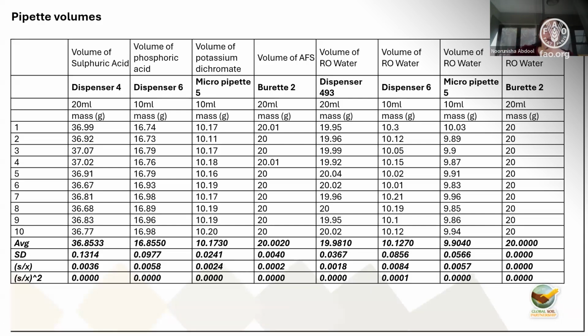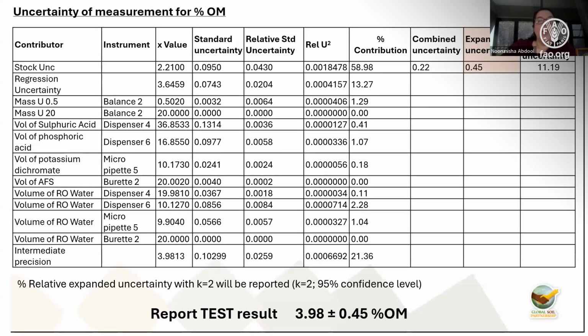Okay, so then I did the mass of sulfuric acid. Obviously, your sulfuric acid is going to have a COA when it comes from your supplier as well. So you'll be able to work out your mass and volumes from your density if you are using liquids in this instance. And then obviously calculate average and standard deviation. So this is a very small, very simplistic example of your measurement uncertainty. You are going to have a table like this at the end of the day. All of these calculations are available to you, so it's not something you have to figure out for yourself.